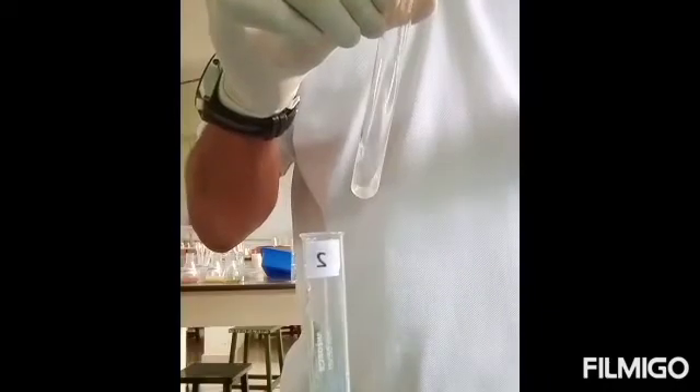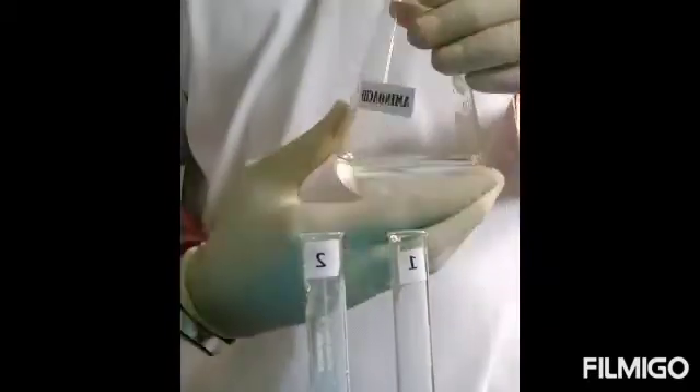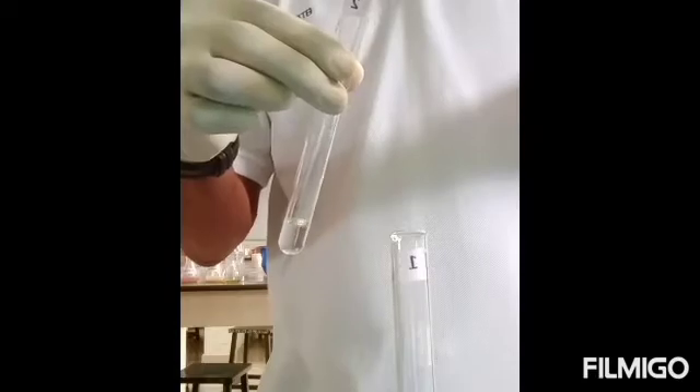Now the tubes are ready. To the first test tube we are adding protein, approximately 2 ml, and to the second test tube we are adding amino acid, approximately 2 ml. To both these test tubes, 2 ml each of Biuret reagent are added.